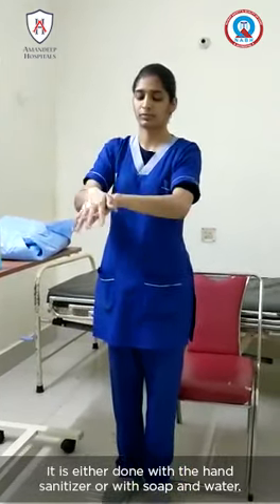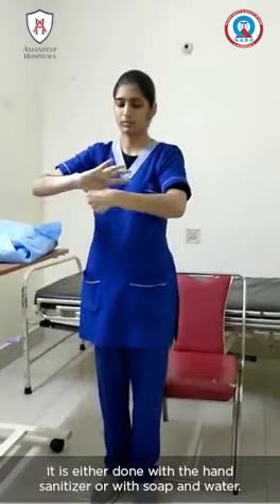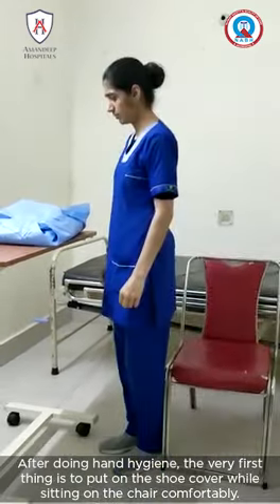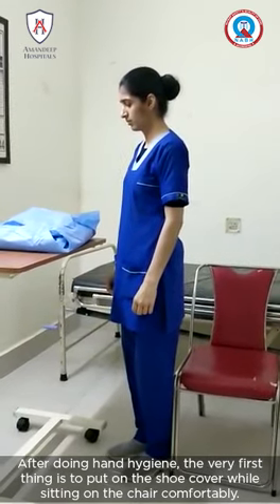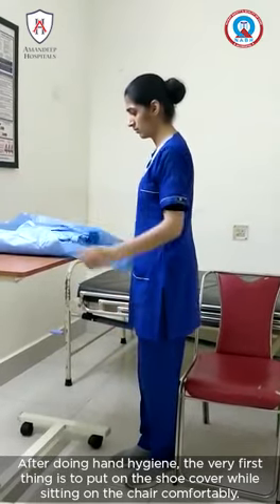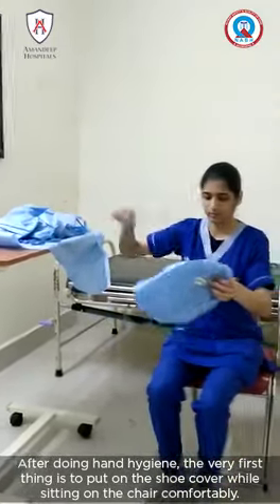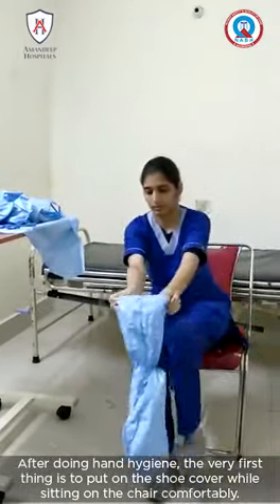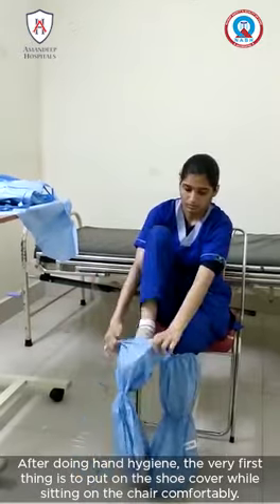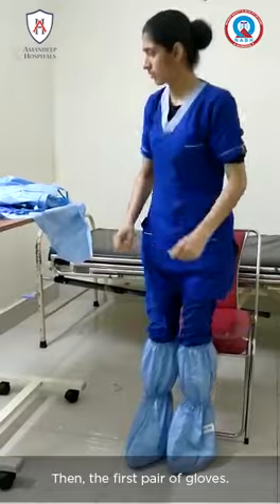After doing hand hygiene, the very first thing is to put on the shoe cover while sitting on the chair comfortably. Then we put on the first pair of gloves.